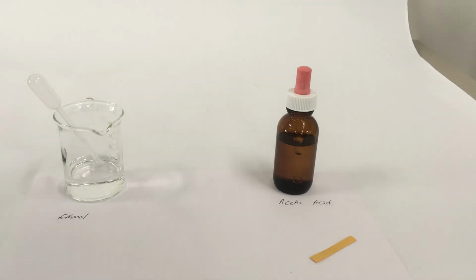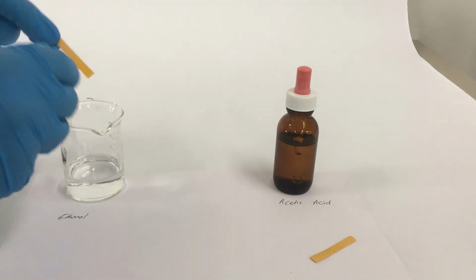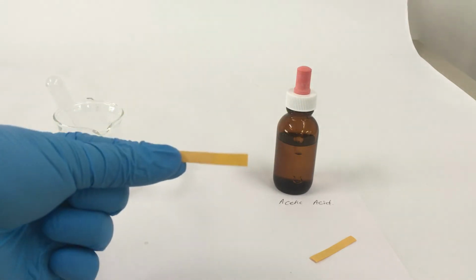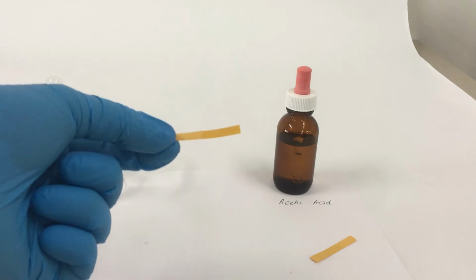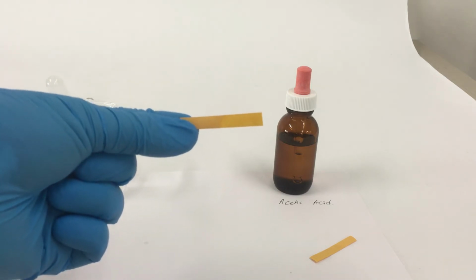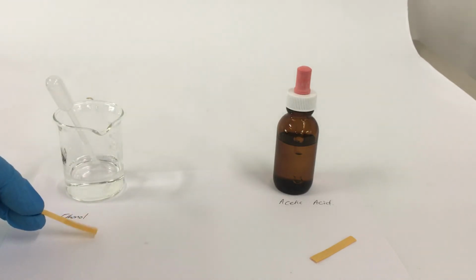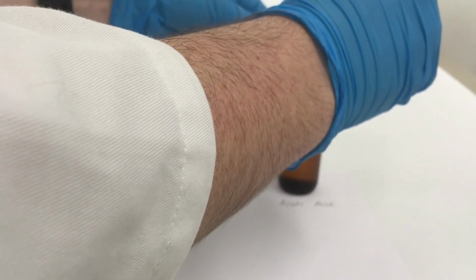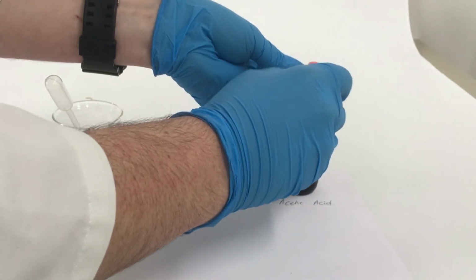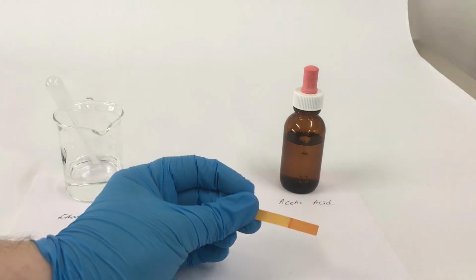Okay, so I'm going to do a quick pH test on these ones for acidity. Now, the ethanol actually doesn't react very well with these pH papers, but that is a neutral reading. So the ethanol comes out just above 7 on there, whereas acetic acid will react as mildly acidic.